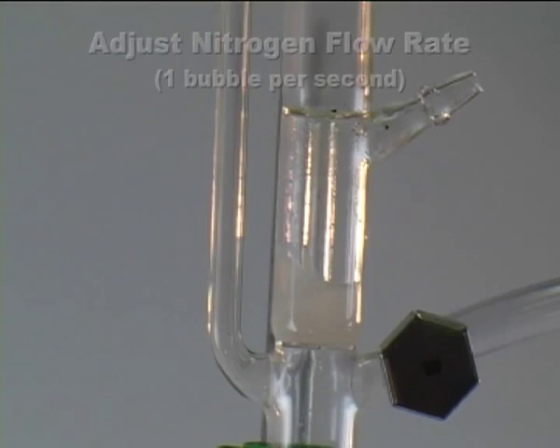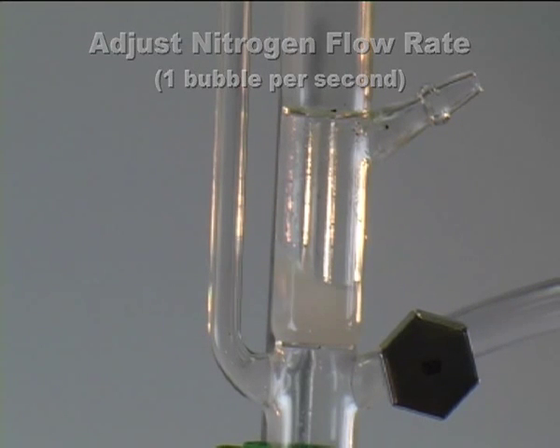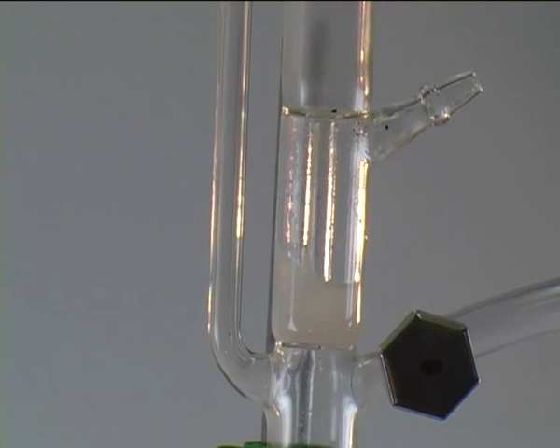Once we have connected everything, we adjust the nitrogen flow rate to one bubble per second, which helps us flush the whole apparatus with our inert gas atmosphere, which is nitrogen.